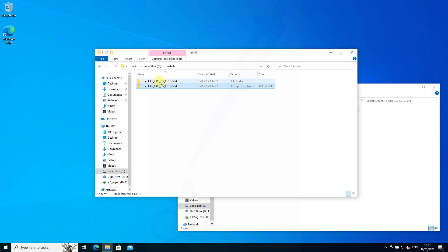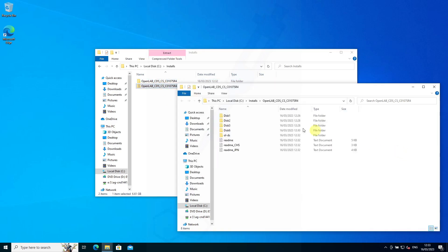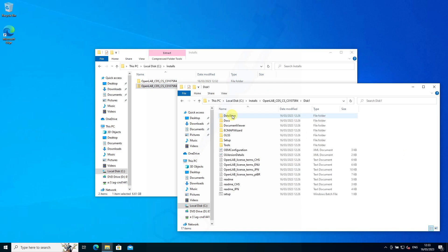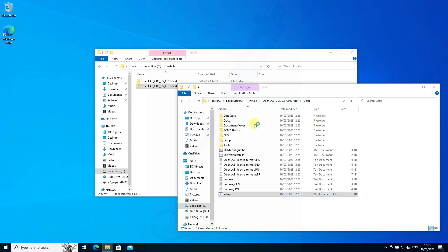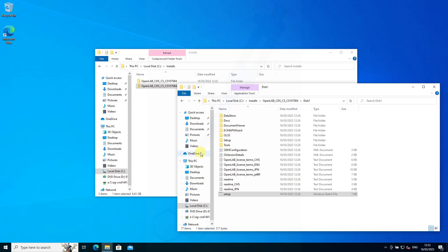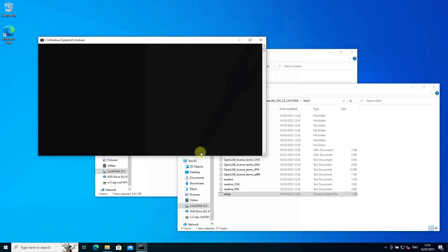I've already extracted the files from the zip file, which you can download provided you have the license agreements and data file. We'll go into disk 1, right-click on the setup, and run as administrator, which should start the installation.